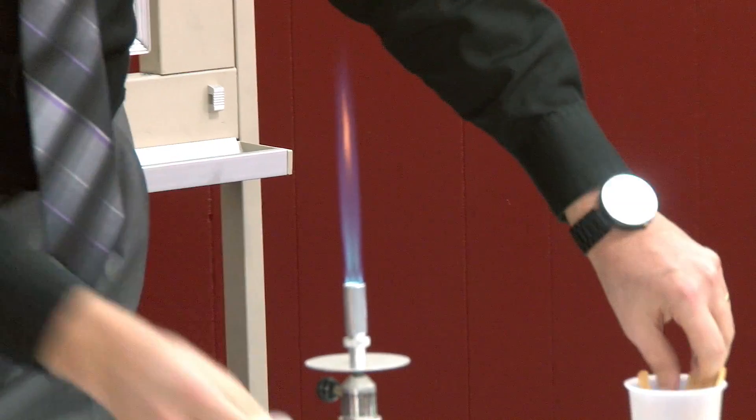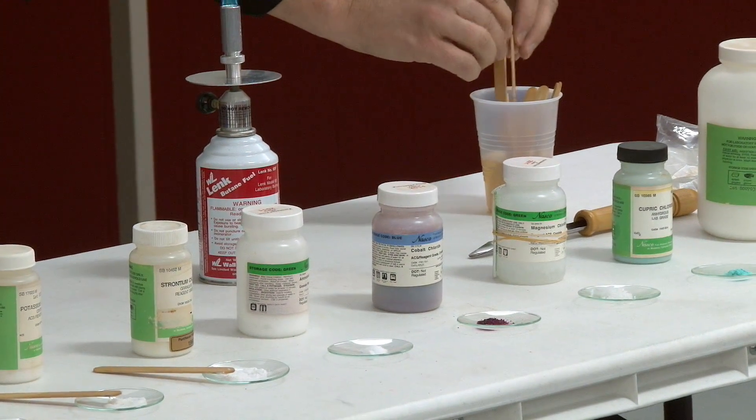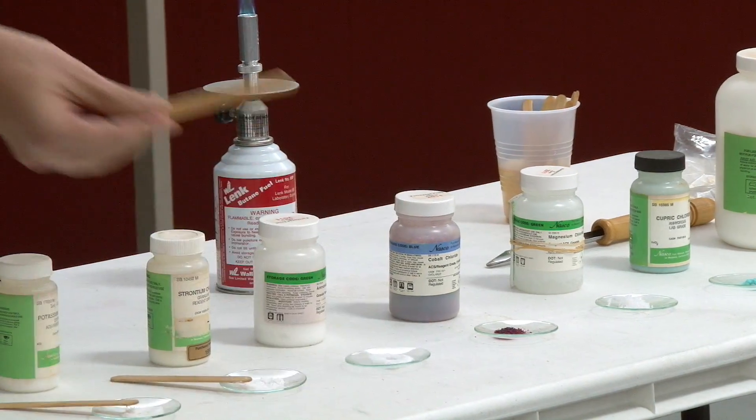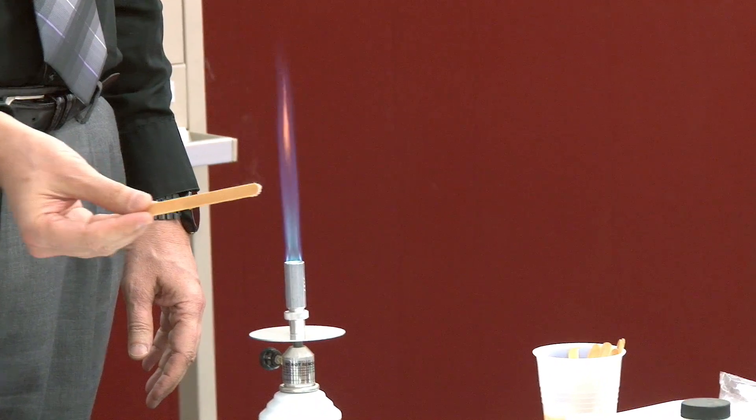This one is ammonium. Now, that's not an element by itself — there's some nitrogen, hydrogen. I don't remember exactly what this one does; this one might not be very dramatic. Orange.